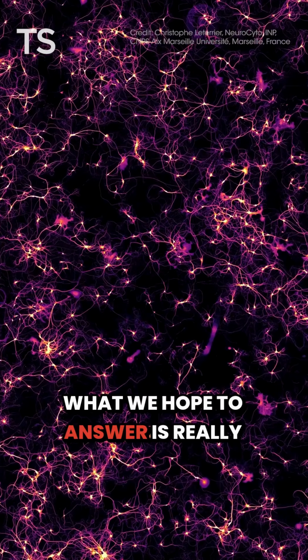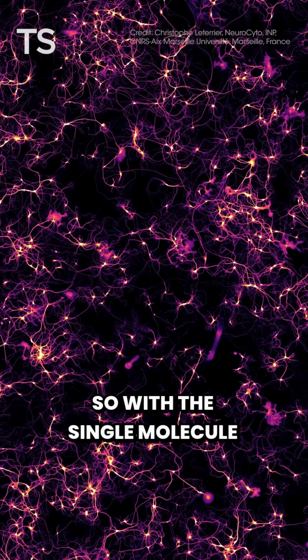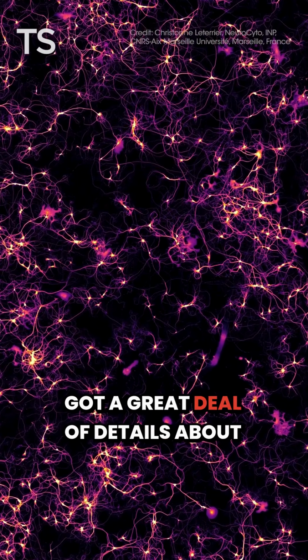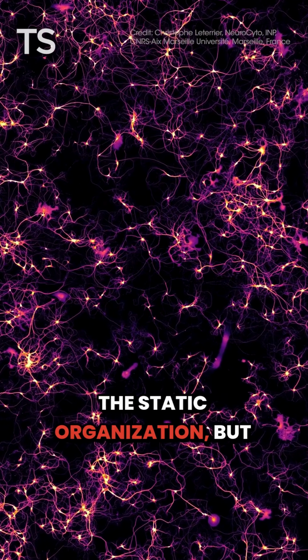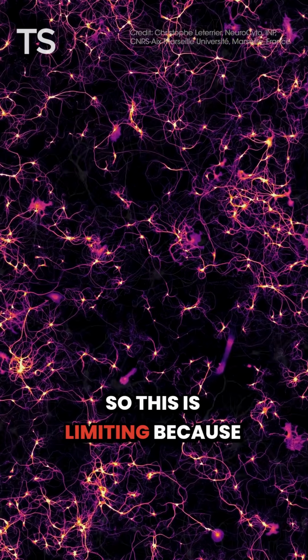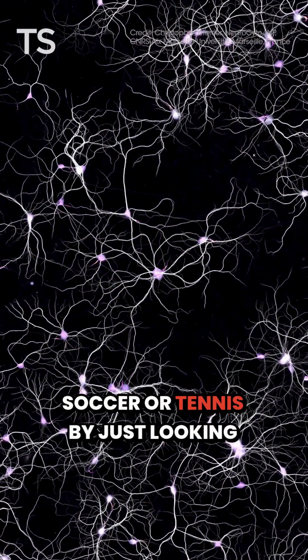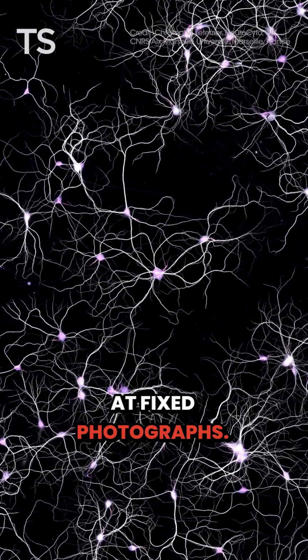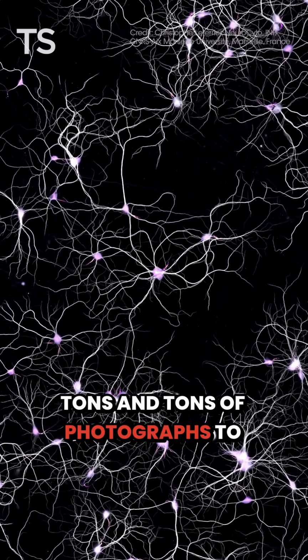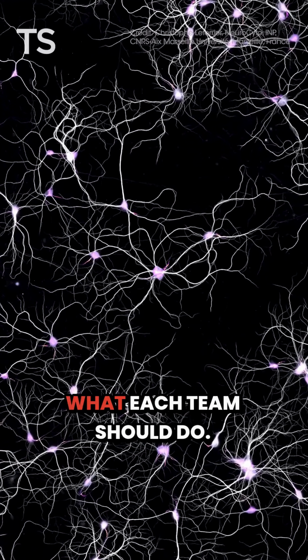What we hope to answer is really to go beyond the static description of the structure. With single molecule localization microscopy, we got a great deal of detail about the static organization, but you are looking at snapshots of fixed cells. This is limiting because imagine you want to understand soccer or tennis by just looking at fixed photographs. Of course, it would be extremely difficult. You would need tons and tons of photographs to get a feeling of how the game is played, what the goal is, and what each team should do.